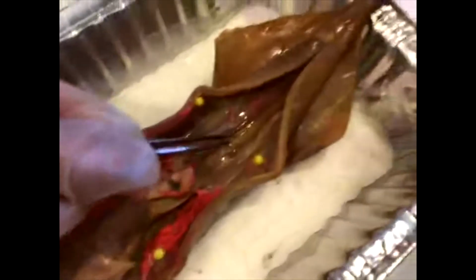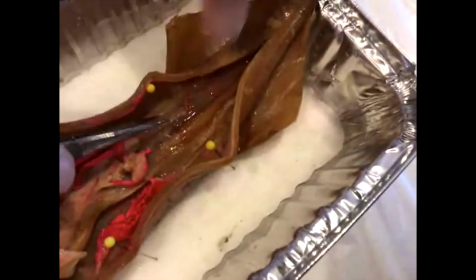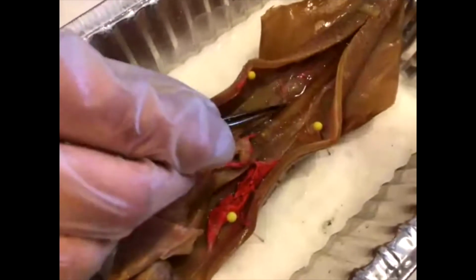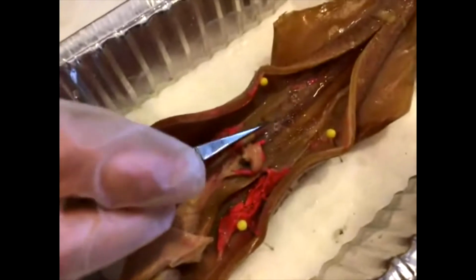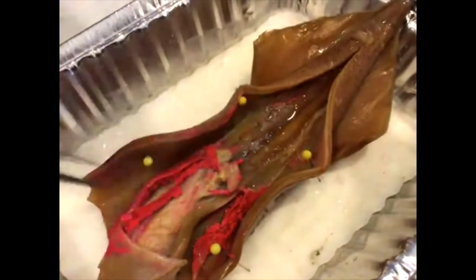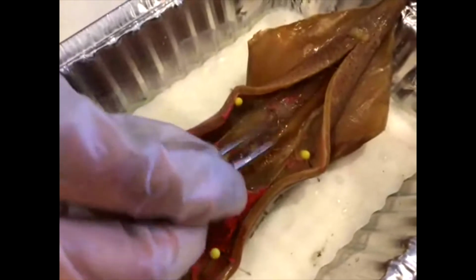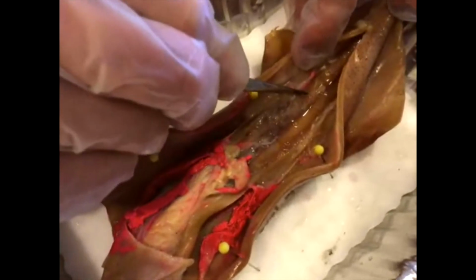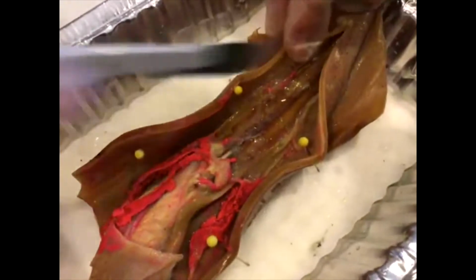Yeah, definitely cool. Okay, and the last thing that I want to take out of here is the pen. A lot of you guys might not know this, but squid are related to shelled organisms in the phylum Mollusca, and those include things like snails and mussels, any animal like clams that you can think of with a shell and live in the ocean. That's what these guys are related to. But since it's a squid, it doesn't actually have a shell on the outside. Instead, it has a bit of a shell on the inside. And the shell isn't quite like a protective covering. It just gives it structure, and it's called the pen.